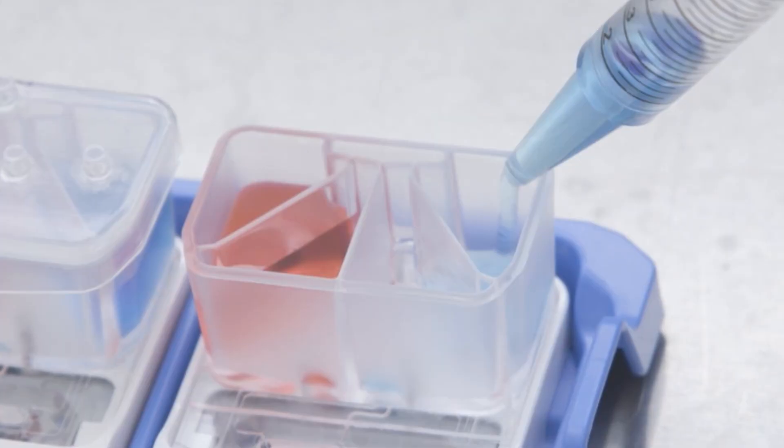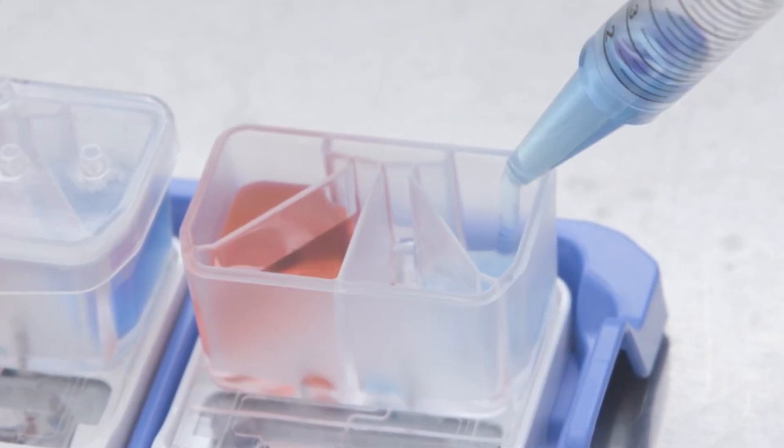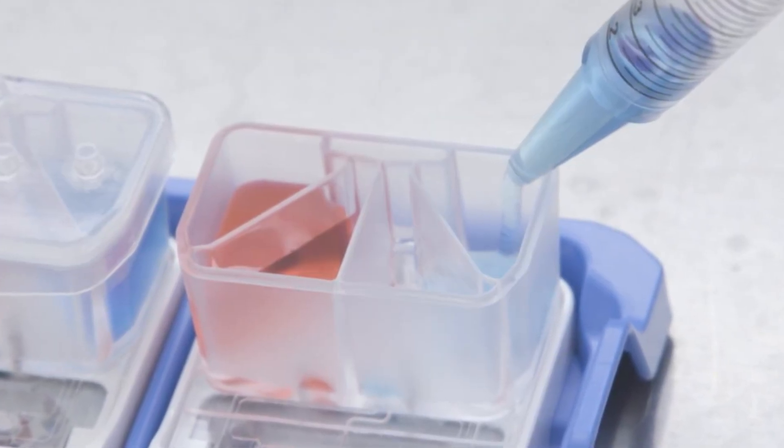We found that liver chip had a sensitivity of 87 percent and a specificity of 100 percent. This means that liver chip was able to identify nine out of every 10 hepatotoxic drugs.